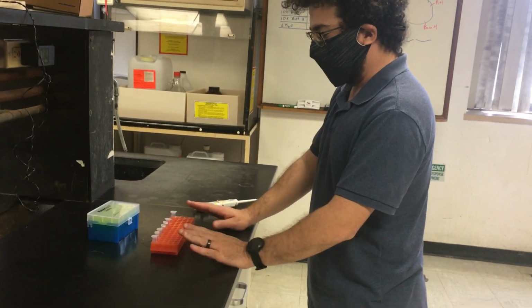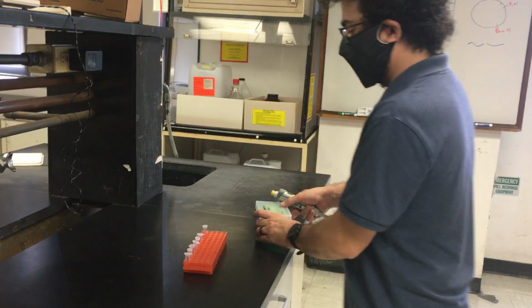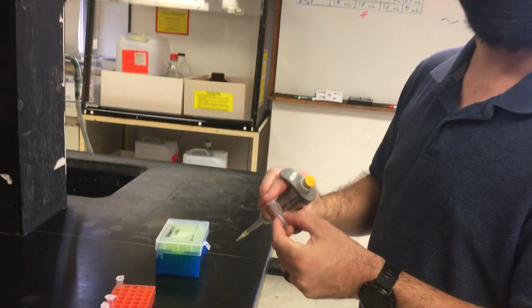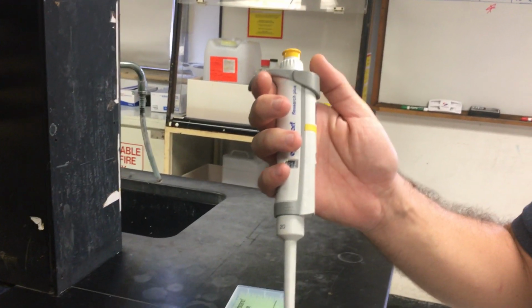Okay, so I've already aliquoted out everything here. To start, we're going to be using the plasmid. So we have 5 microliters. And remember, we will use the micropipette. Remember, we have an explanation of how to use it.